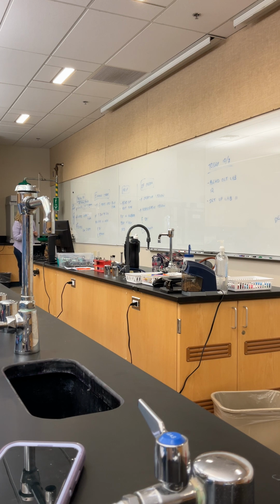So we would report him as being negative, because we're not seeing a reaction change. All right? Does that make sense? So we're looking for acidity to build up. So he's negative for the acid and gas, but is there still some fermentation going on? We're going to say negative because we're looking for either yellow or red. It is a very clear test. I want yellow or I want red.